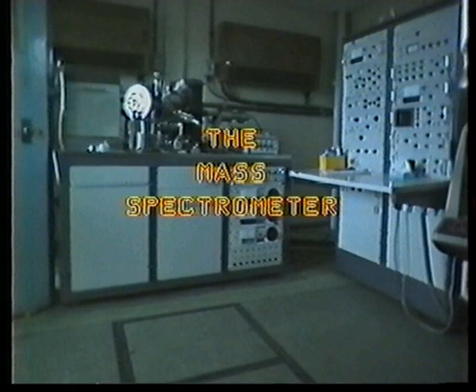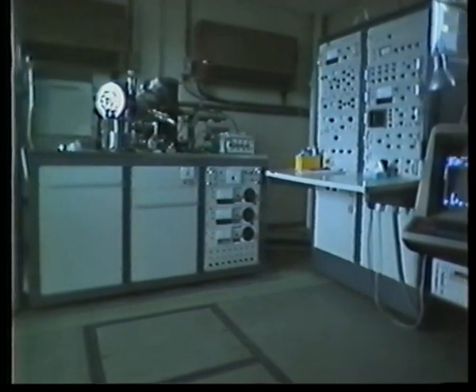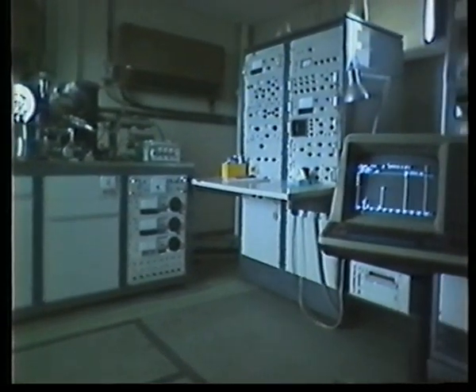A mass spectrometer is able to analyze substances into their component parts. Here on the left is a mass spectrometer with all the associated equipment used to analyze the output here on the right.